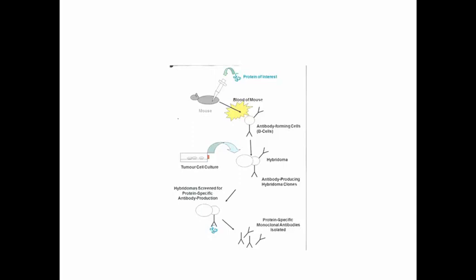So of all those proteins you see in S1, for example, or the multiple proteins that you have still in S2, you can say out of all those proteins, here is where my aldolase was. So this is what you're going to be doing at the end of the experiment.